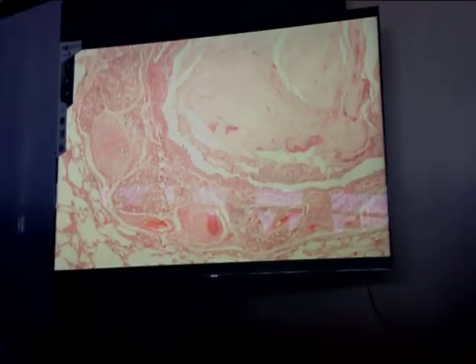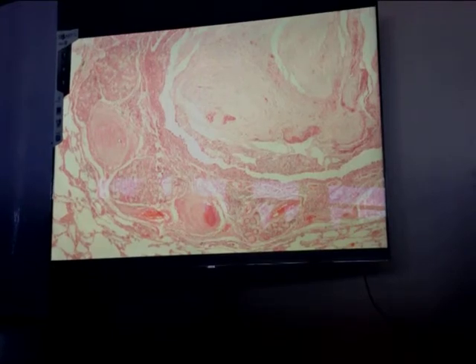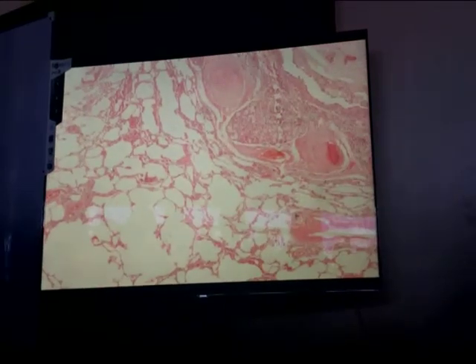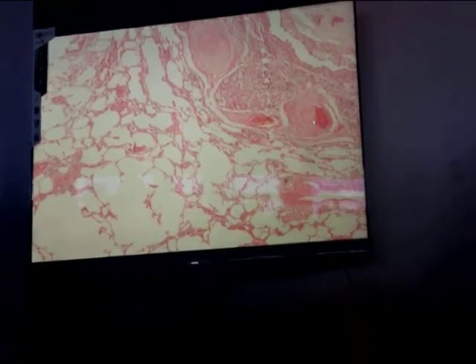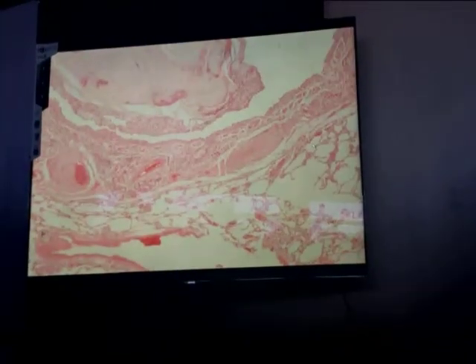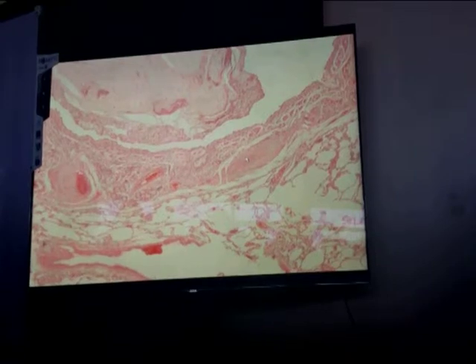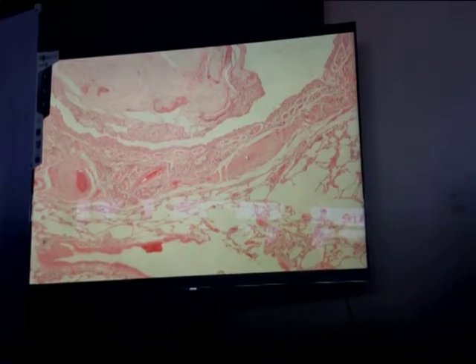So how do you classify that airway? A bronchus. How about this airway? Bronchiole. Now, what is the purpose of the hyaline cartilage in the bronchus? Okay. Plate of hyaline cartilage, another plate of hyaline cartilage, another plate of hyaline cartilage. To maintain the patency of the bronchi.